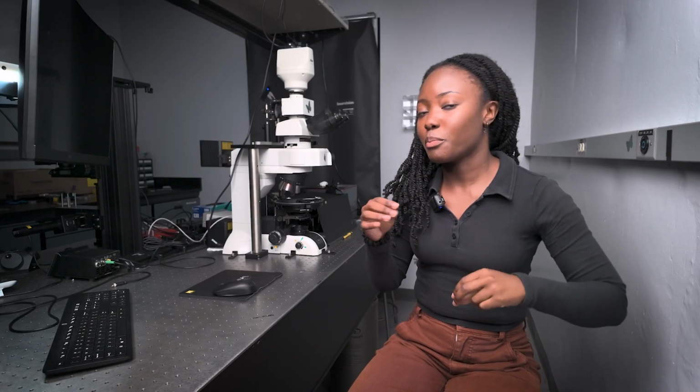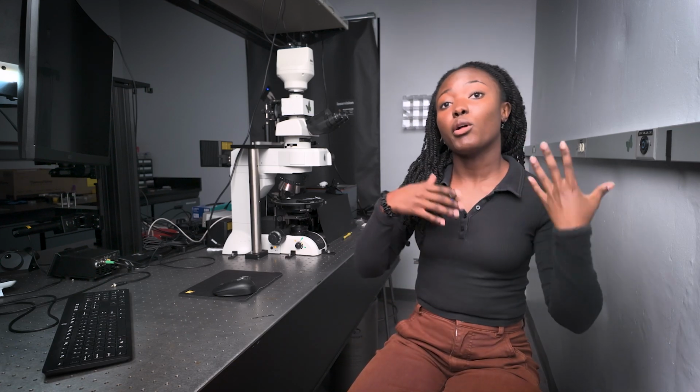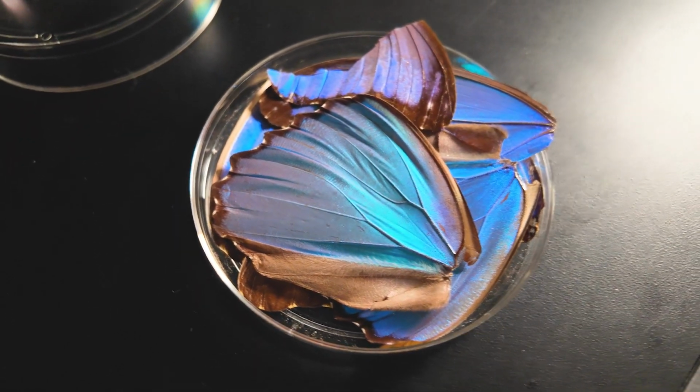And so this is something that we could use for imaging tissues, because tissues have biological fibers, the most abundant fiber being collagen. And collagen fibers are also very sensitive to the polarization of light. The only issue is that property in biological tissues is much weaker.